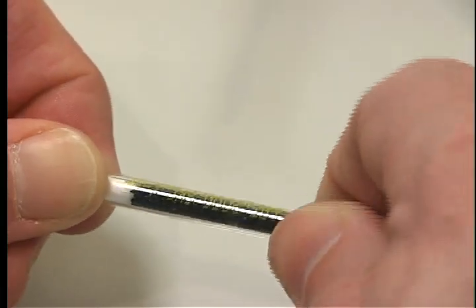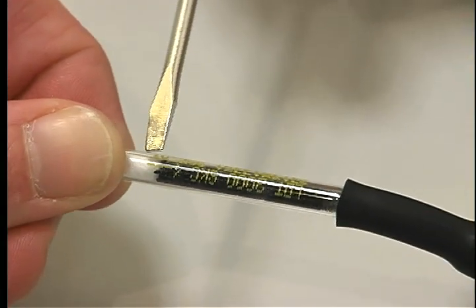Insert the open sorbent tube into the holder's rubber sleeve, with the arrow on the tube pointed toward the holder.